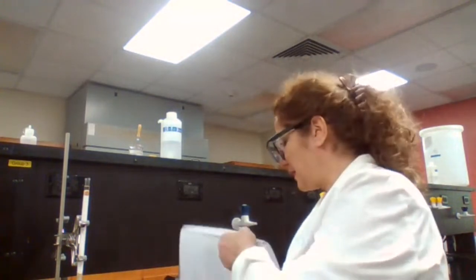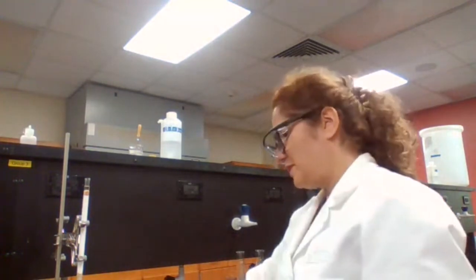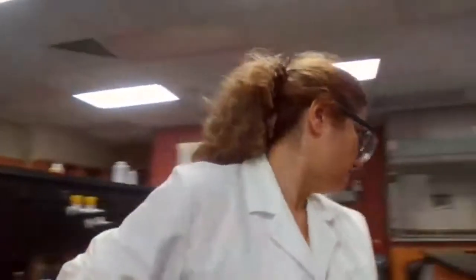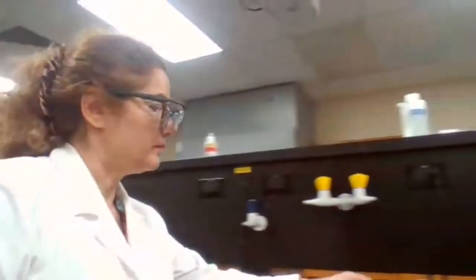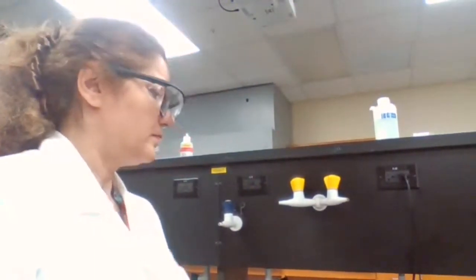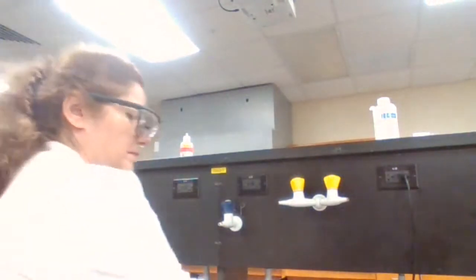Okay. I get the 0.2 grams of fluorene mixture. So I add enough to make it 0.2 grams.